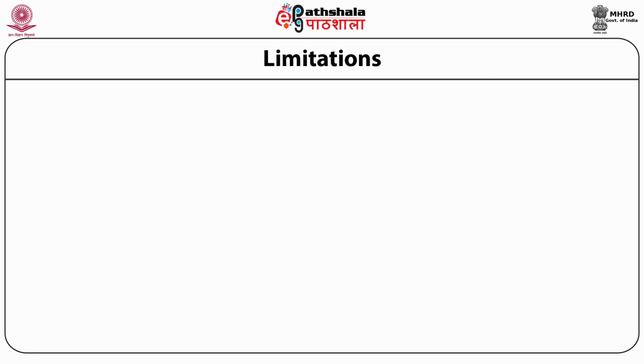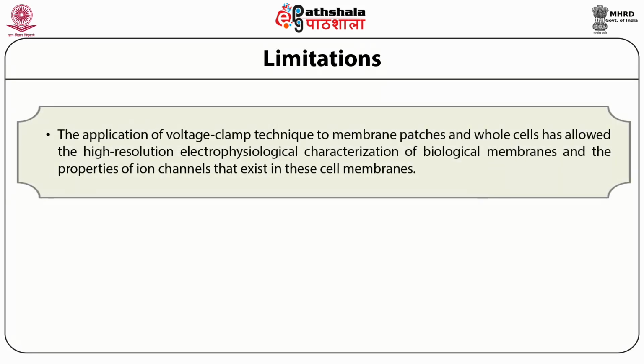Limitations of this technique. The application of voltage clamp technique to membrane patches and whole cells has allowed the high resolution electrophysiological characterization of biological membranes and the properties of ion channels that exist in these membranes.